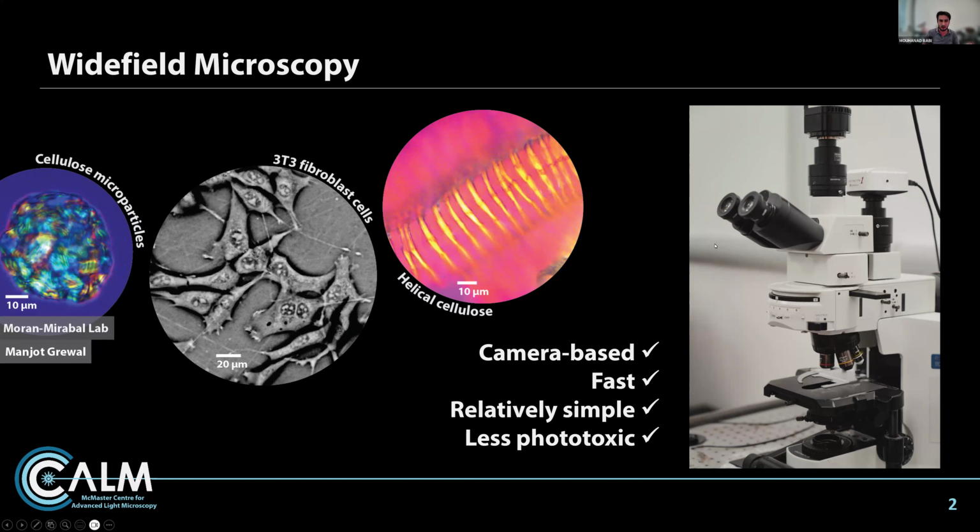The nice thing about bright field or transmitted white light imaging is that we don't necessarily need to label our samples with anything. So we could look at, for example, cell morphology, cell division, and dynamics without having to do any sort of labeling, like what we see here with the transmitted white light image.